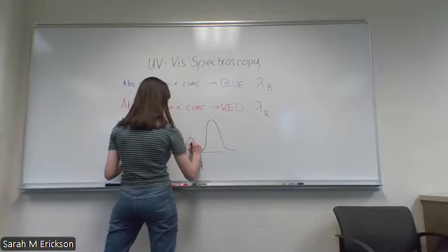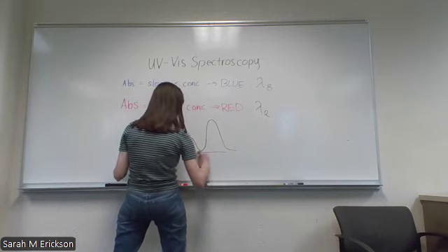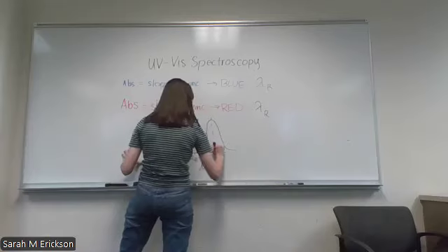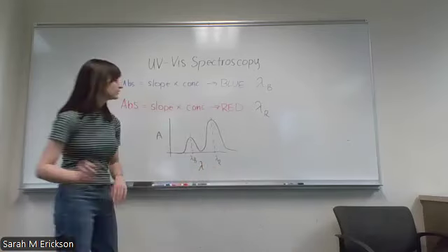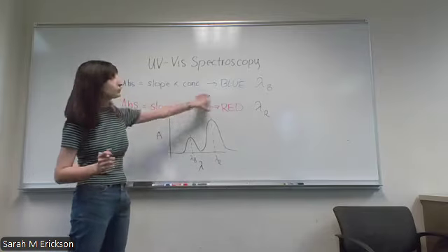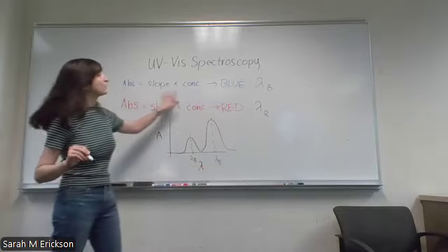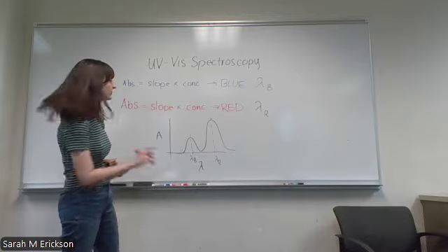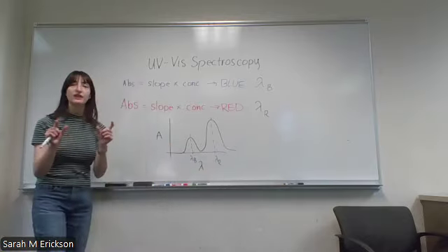One of these peaks will have the wavelength for the blue dye, and one of them will have the wavelength for the red dye. So if you remember, red always absorbs at the same wavelength. So when you did all of your solutions of red, those are going to come out as one wavelength. And blue always absorbs at the same wavelength for blue. So all of those will come out of blue. So that's how you know which peak is which. Those wavelengths will be identical.